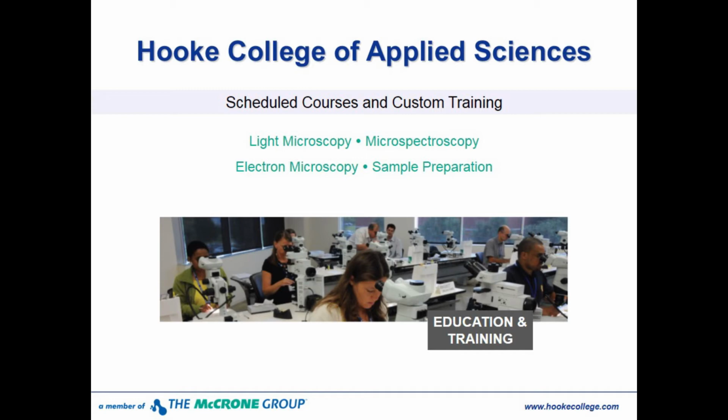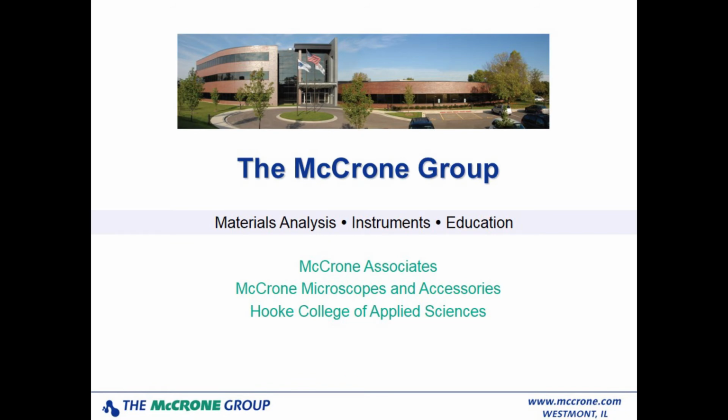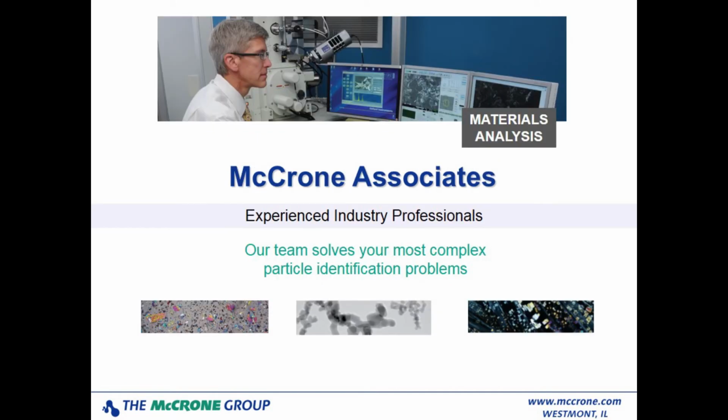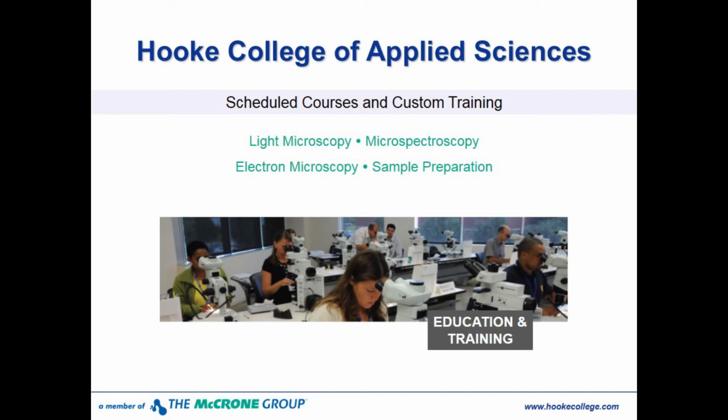So I think the answer to the question is it depends very much on your skill set. In my particular case, I've done a great deal of PLM work from the late 70s and early 80s. I feel like I have some pretty good skills about recognizing things with that. And so I would favor using the PLM first. Secondarily, one reason I like using the optical microscope to begin with is, for instance, if we're looking at a biological material, or we're looking at something like a hair, you know that right away, and there are not too many other ways that you can determine that this is a biological origin, a plant origin, or another origin of such sorts. And if you just go directly to spectroscopy, it may be a little bit difficult to backtrack and get to that result.